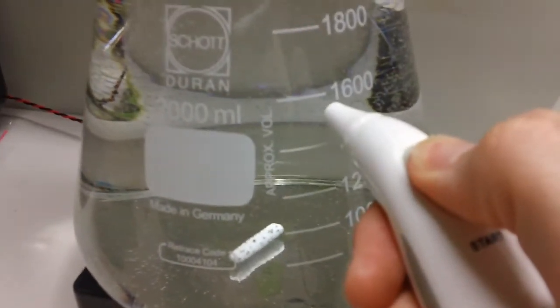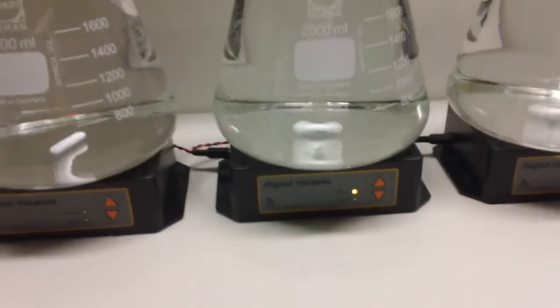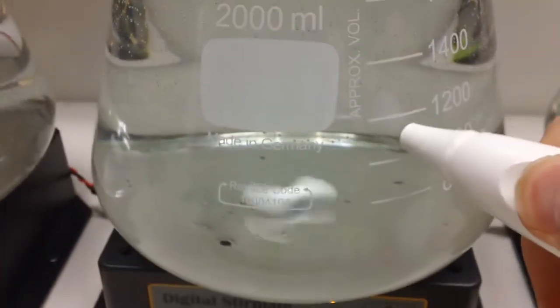So the control here is 27.3, I'll just write that down, 27.3 degrees Celsius. Running at 500 RPM has given us 27.9 degrees, so that's 0.6 there already.